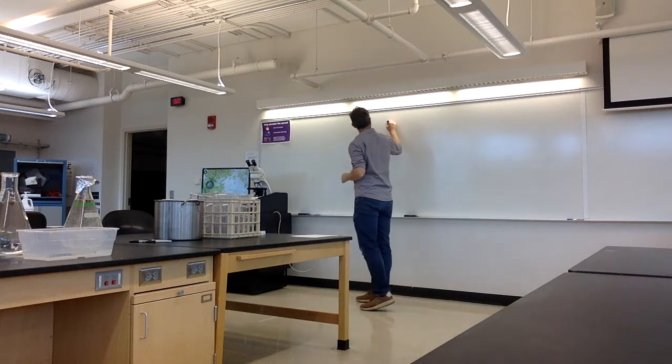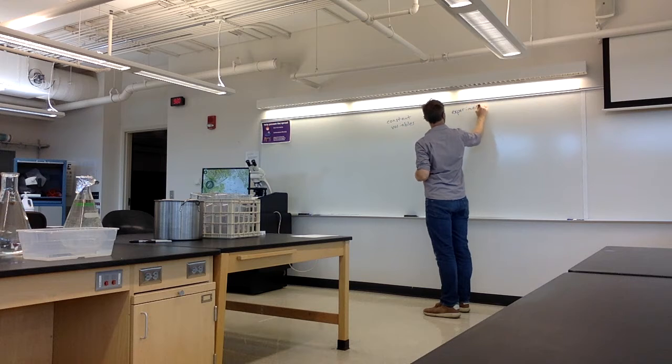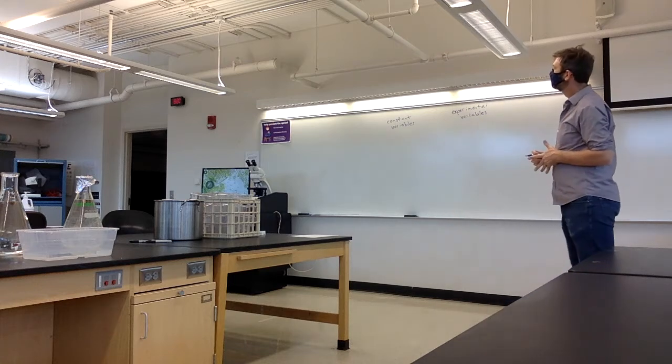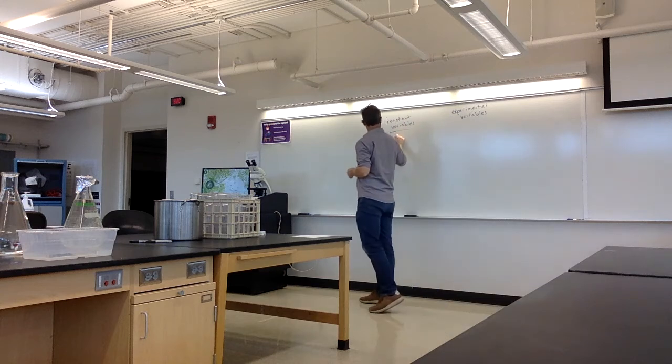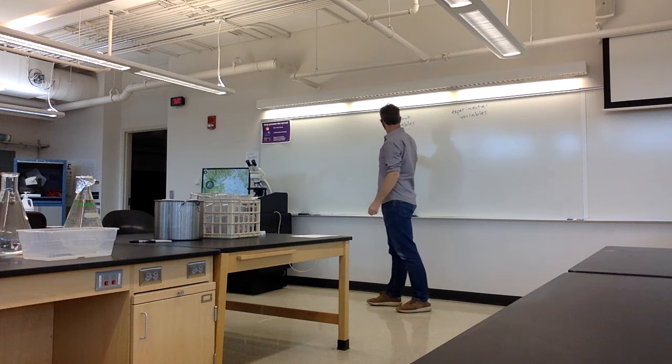So what kind of things are we going to hold constant? Temperature? Light?